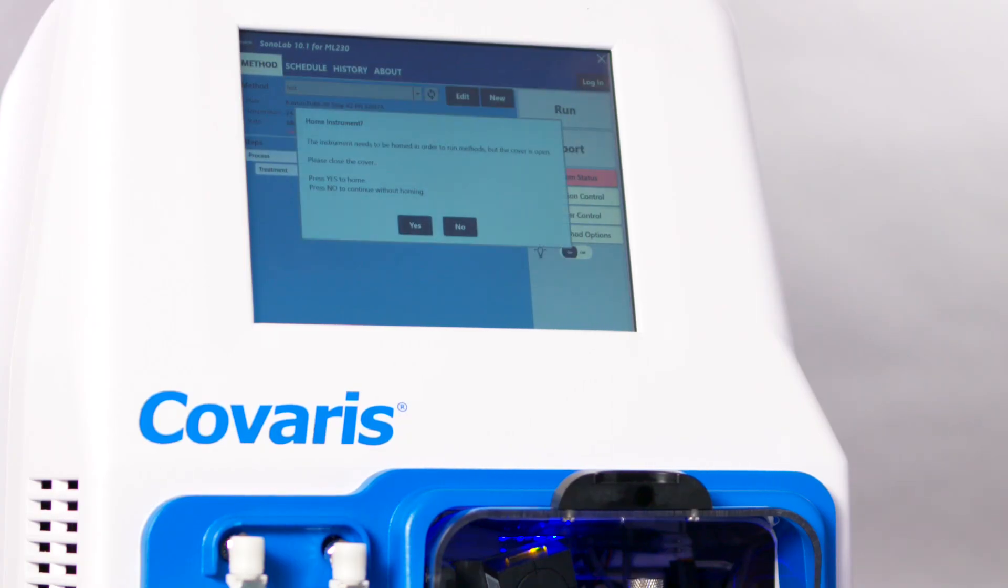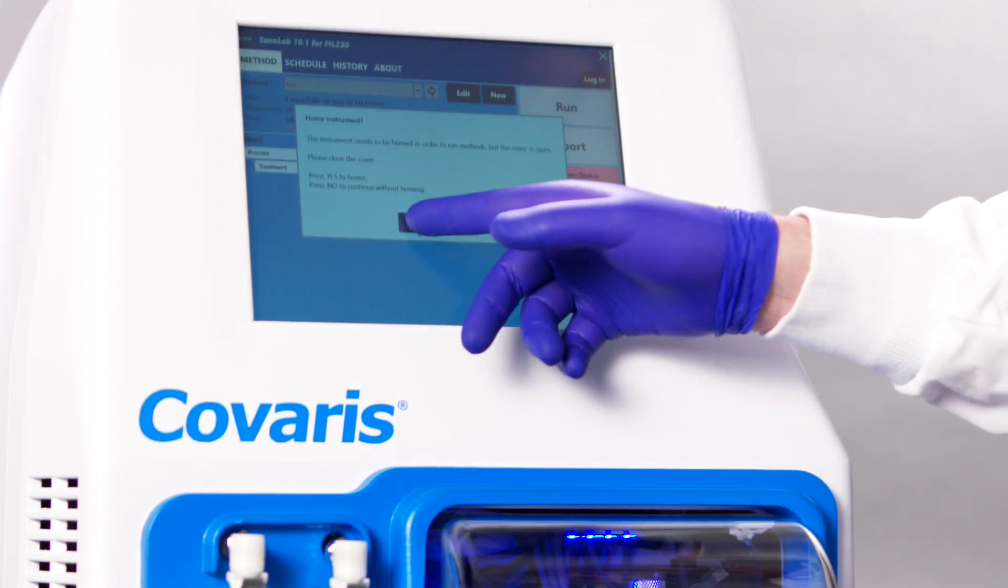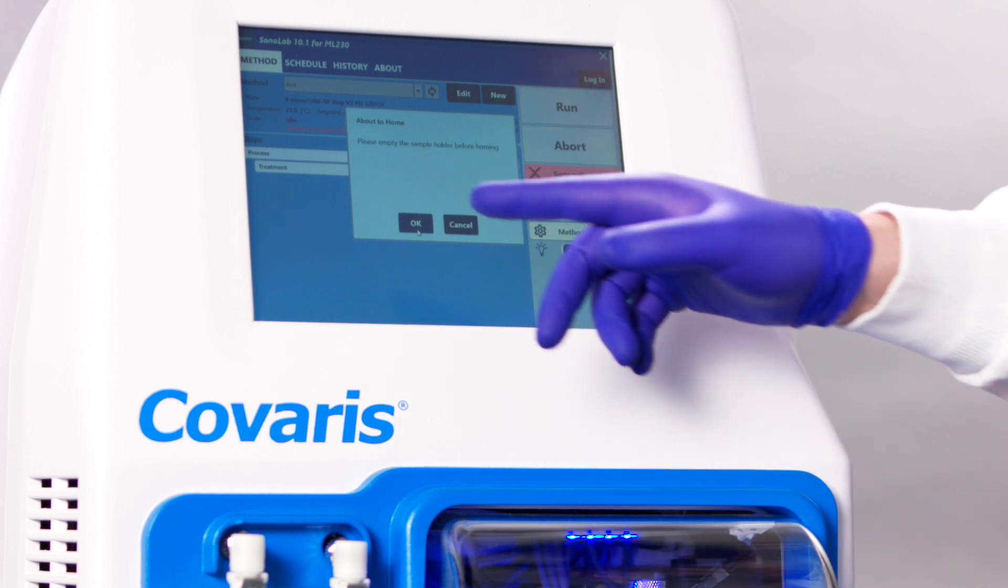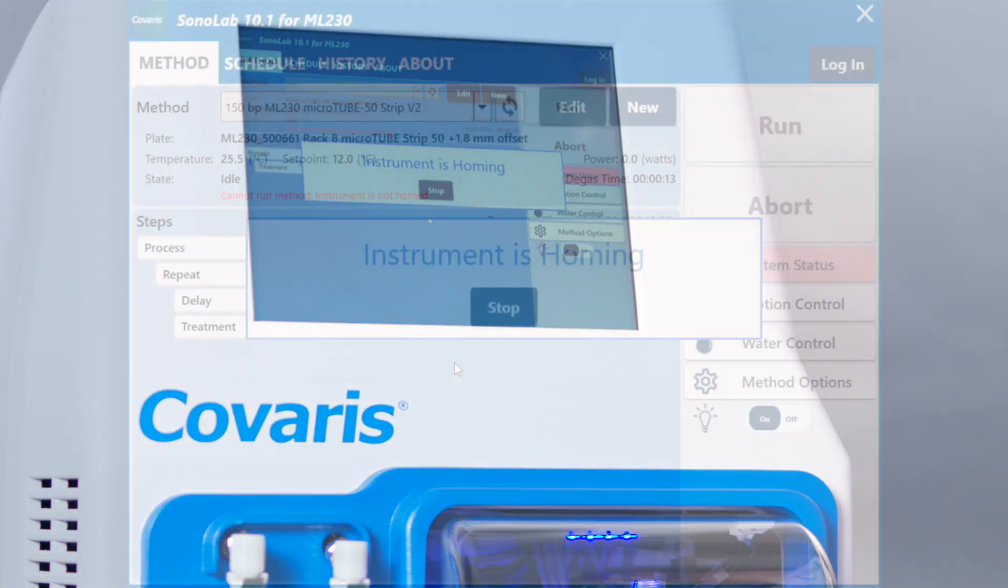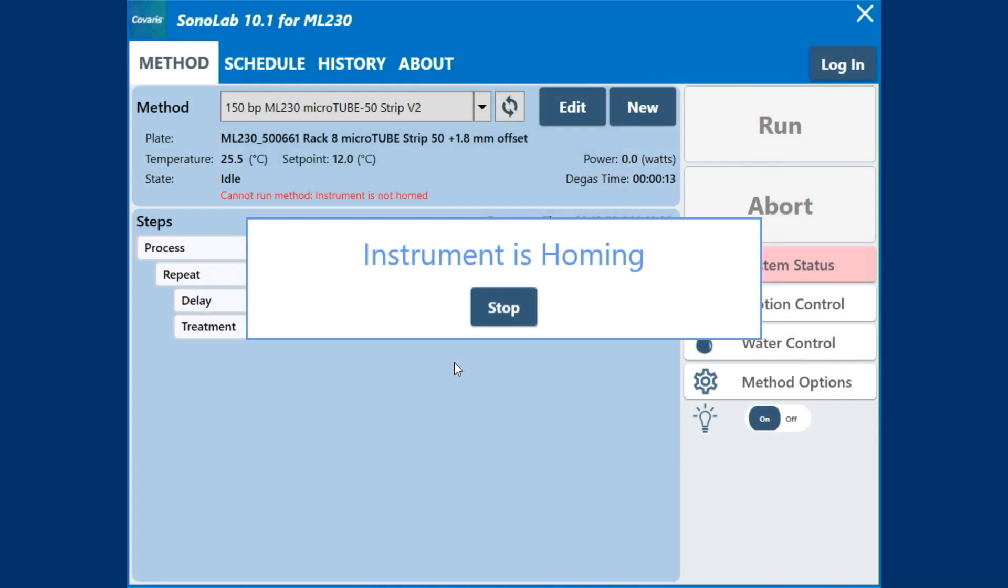Sonolab will automatically open and a window will appear asking whether the instrument is to be homed. Touch Yes to confirm there are no items on the sample arm. The motion system will perform its initialization sequence. The homing window will close and the Sonolab home screen will be displayed.